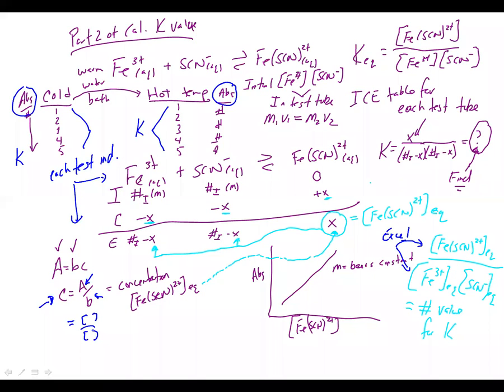Yeah, I think, again, you want to make sure you go through, there should still be the data analysis part of the experiment. So you want to make sure you go and calculate whatever they tell you to calculate. But my guess is, since you did a whole bunch of them, something like an average value would be a good idea to calculate for the hot temperature to cold temperature. And that way in your report, you can maybe just talk about the average K value for the cold was this, the average K value for the hot was this. And you can maybe talk about, are they close to each other? Are they very different because of temperature change?